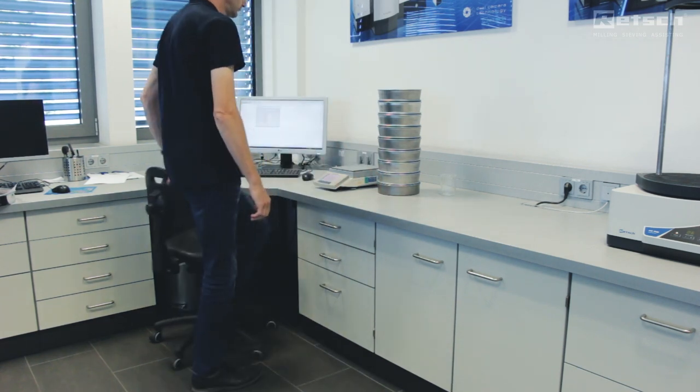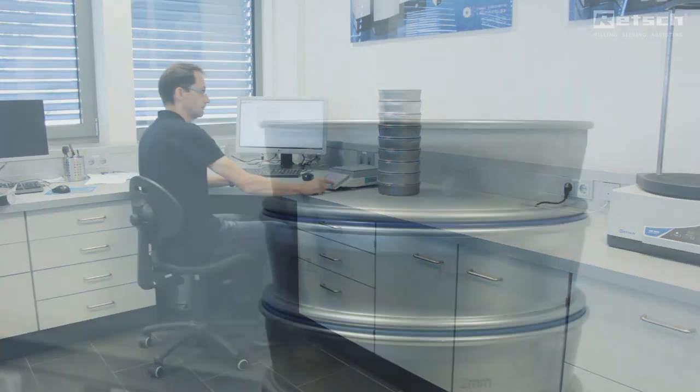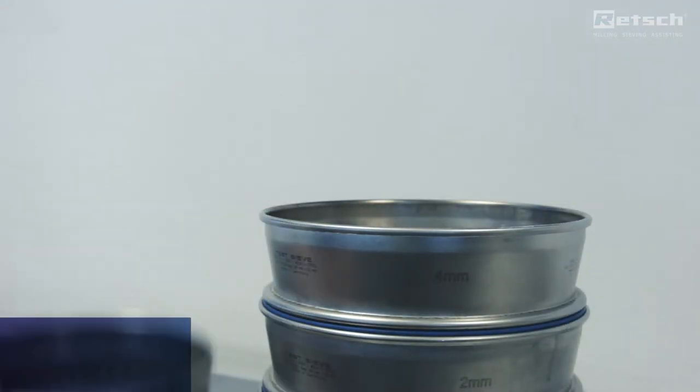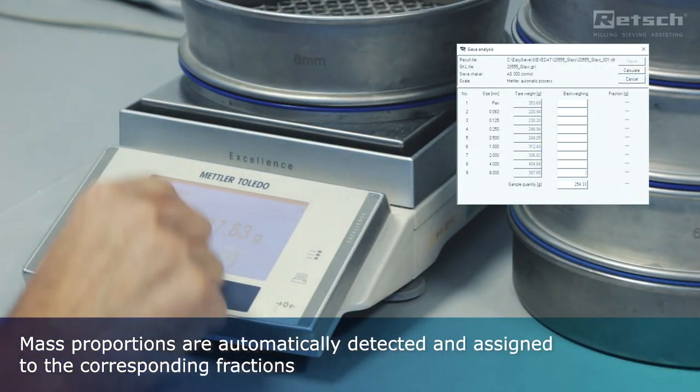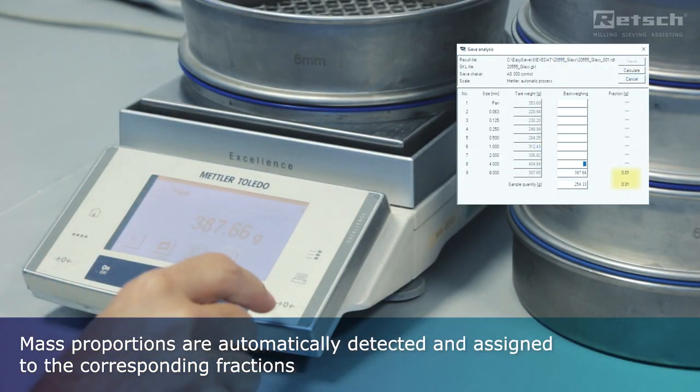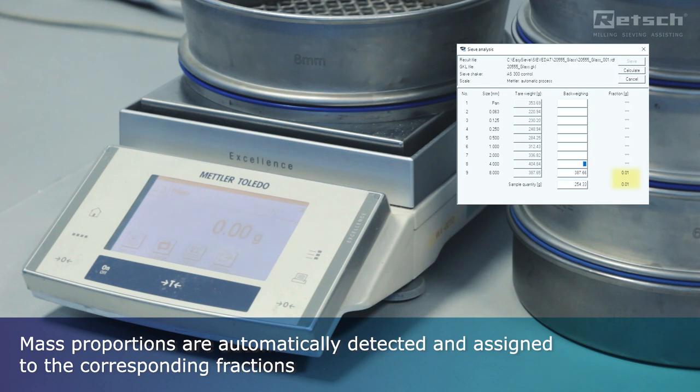After the sieving process, the sieves are re-weighed. By determining the weight difference, the program automatically detects mass proportions and assigns them accordingly to the corresponding fractions. No math required.